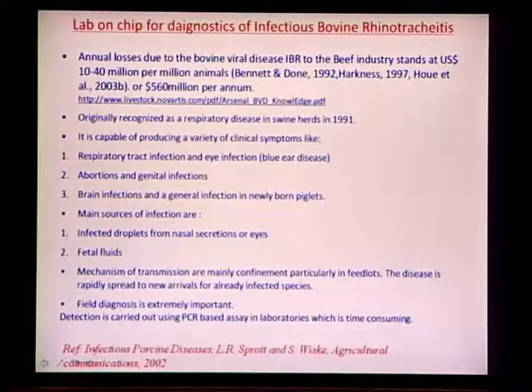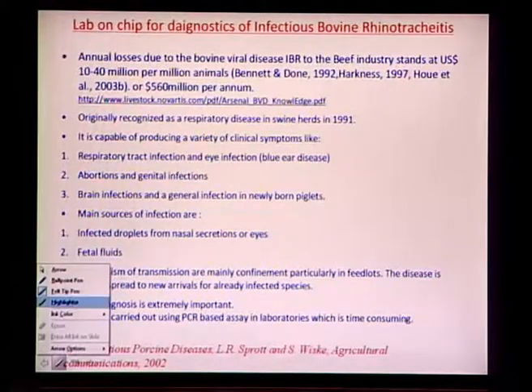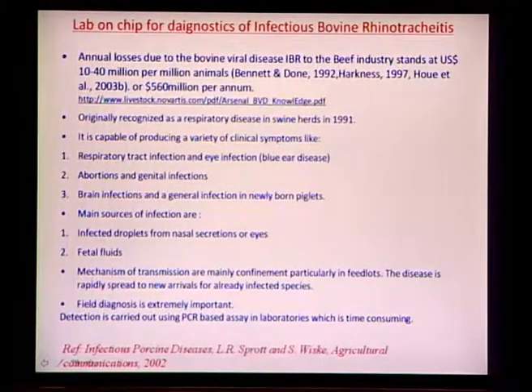Let me now go a little bit ahead and show you another example of previous work which had been done by our laboratory. This is for the lab-on-chip based diagnostics of the disease infectious bovine rhinotracheitis. Now, I would like to give a little bit of background information on this particular study.